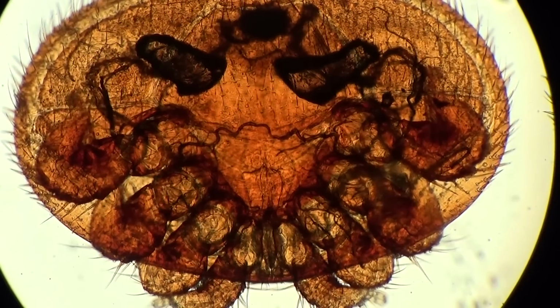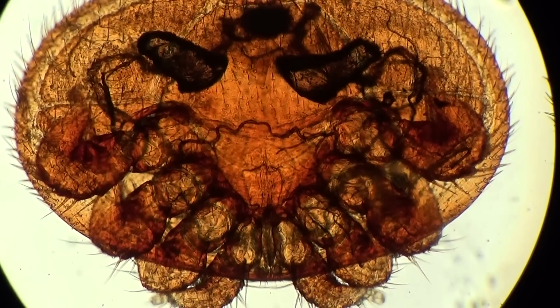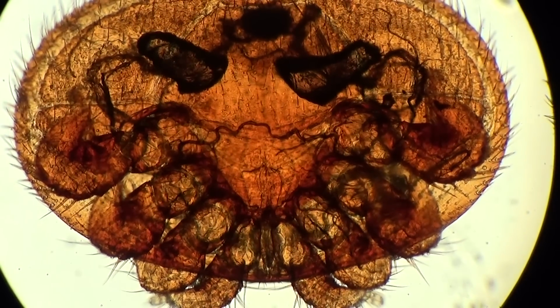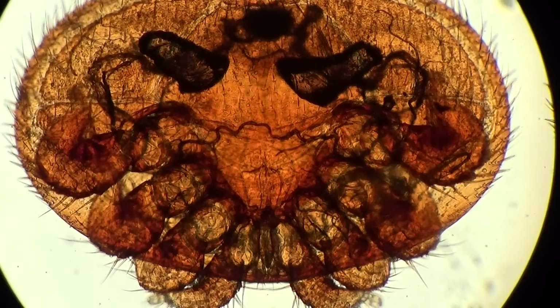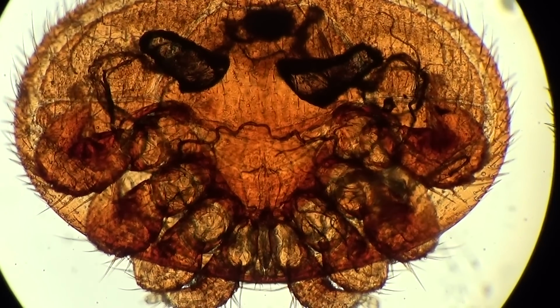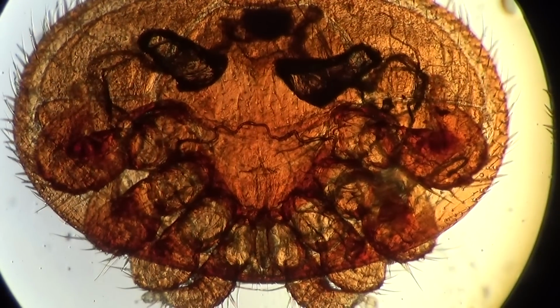Well, mites reproduce in 10-day cycles. How are they developing? They are developing inside honeybee cells. Overwintering mites enter the honeybee cells and the female oviposits.